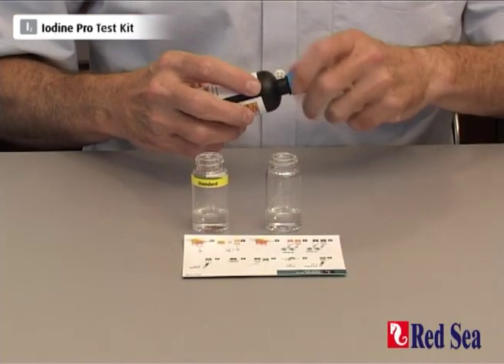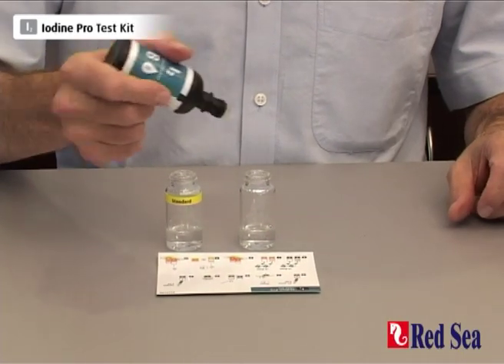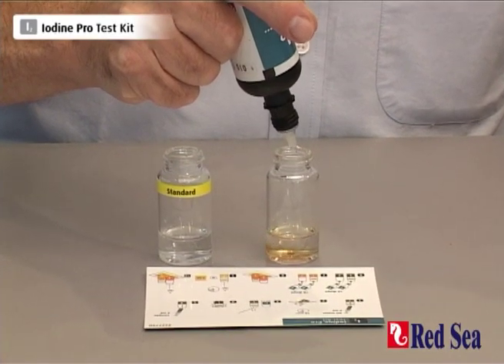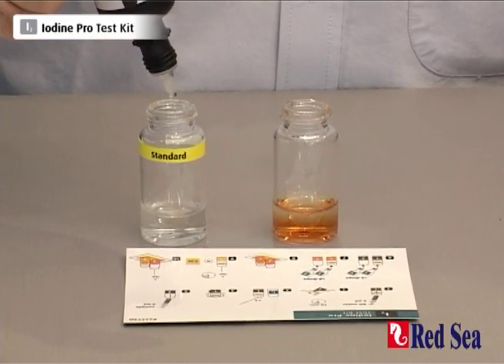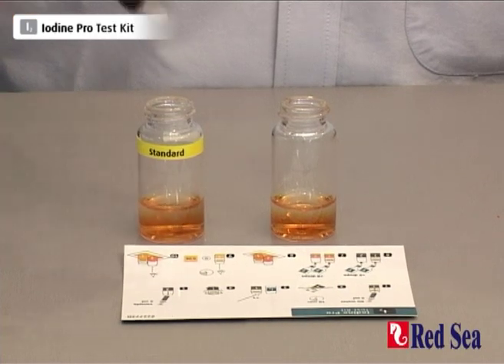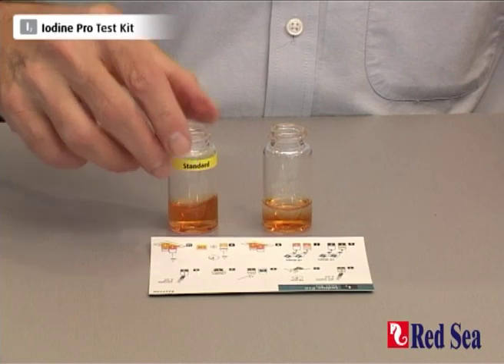We now take reagent B and we add 8 drops to each: 1, 2, 3, 4, 5, 6, 7, 8 — and 1, 2, 3, 4, 5, 6, 7, 8. A little swirl for both.